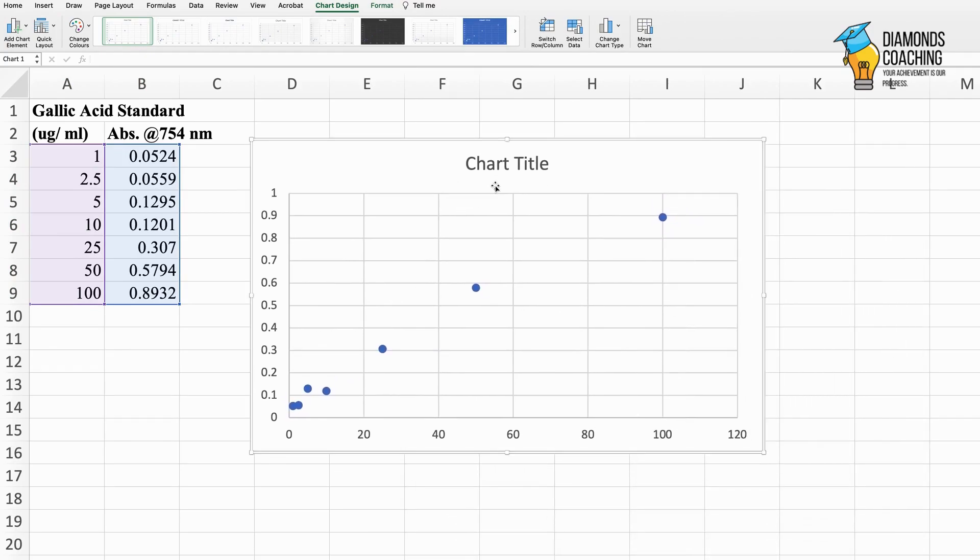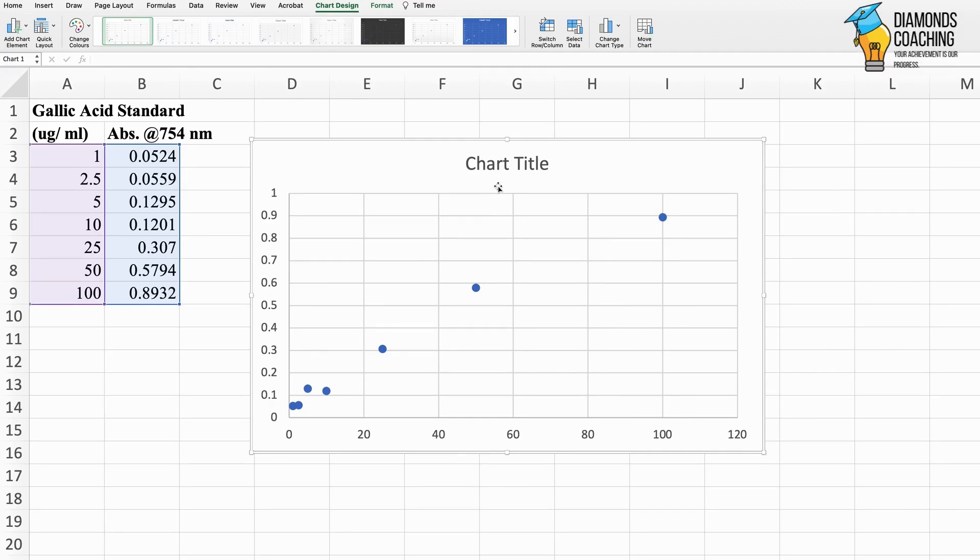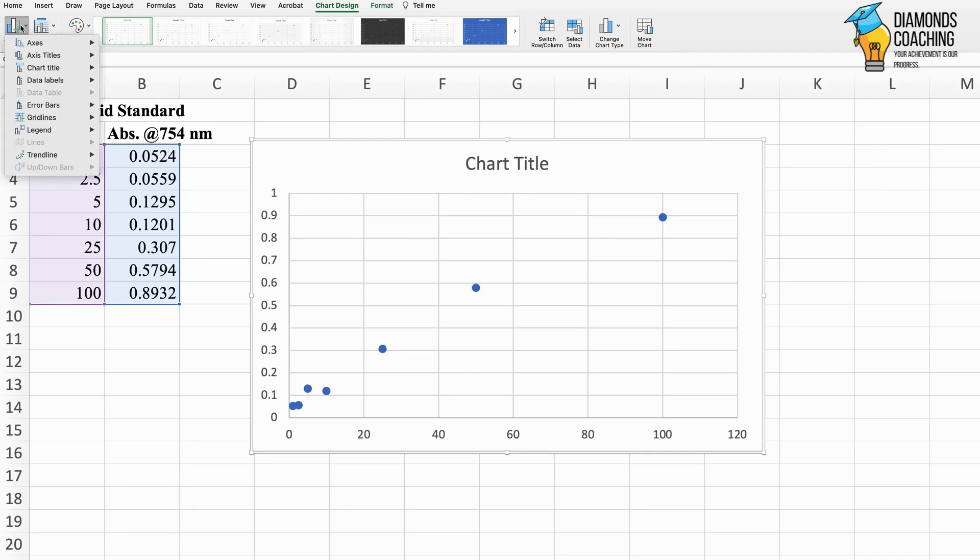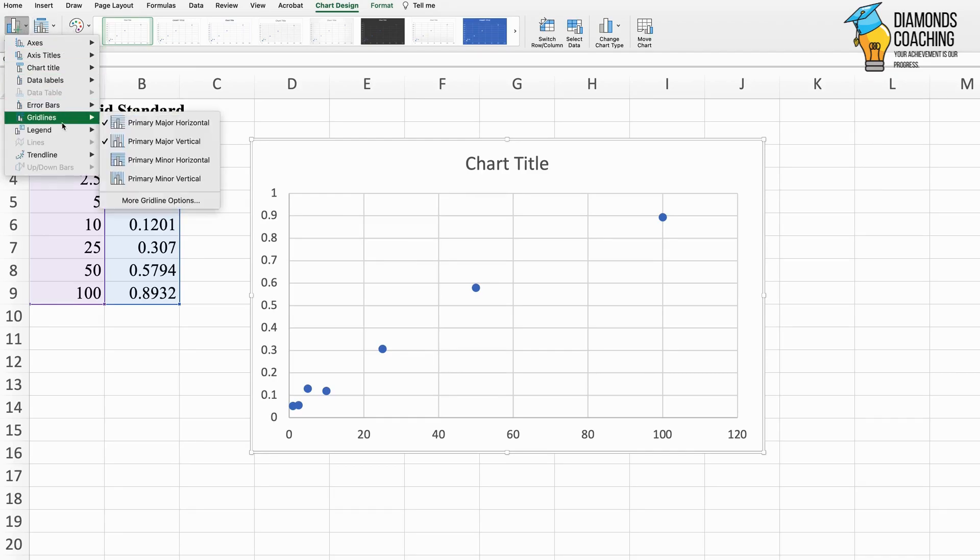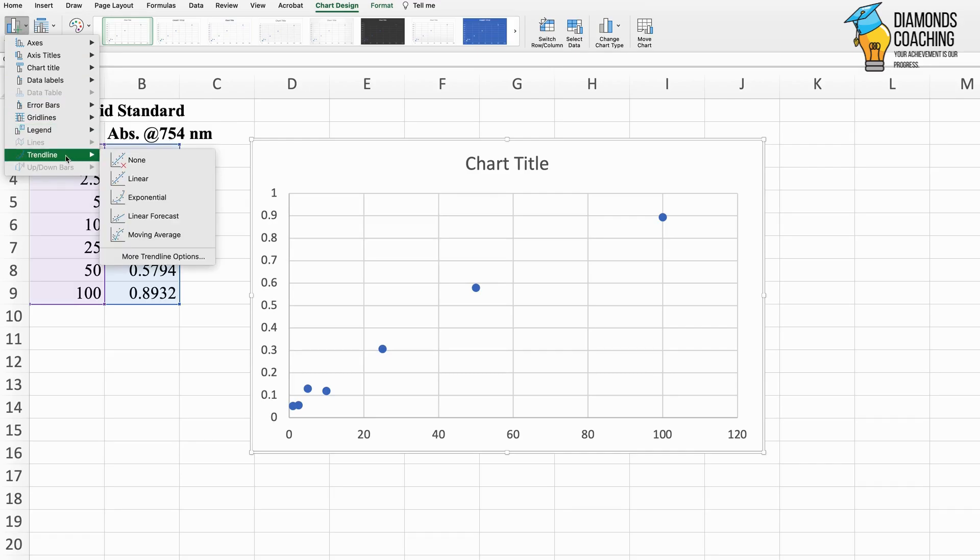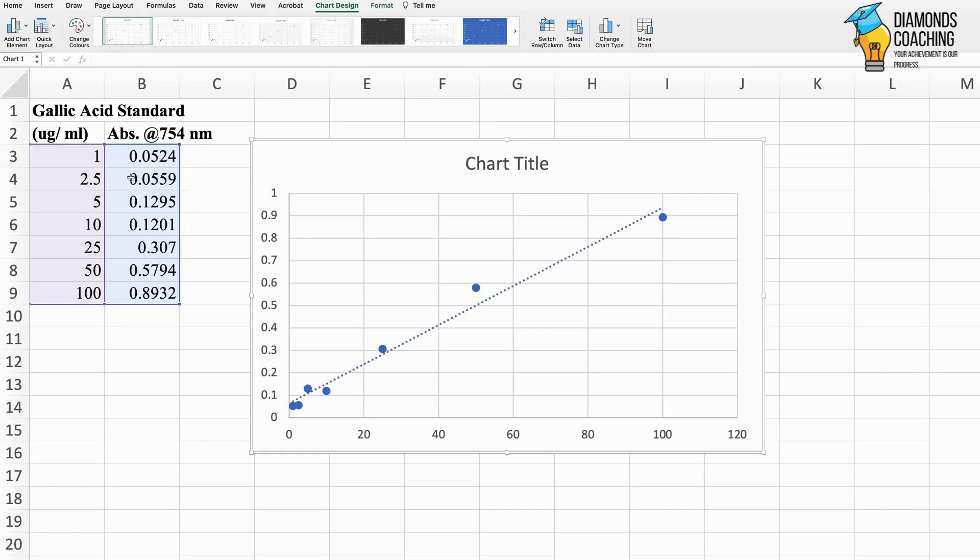Now I want to add certain elements where I will also add the equation, that is y = mx + c, from where we calculated the phenolic content in the previous video. Let me add the elements. I'll first add chart element and add a trend line, which is a linear trend line.